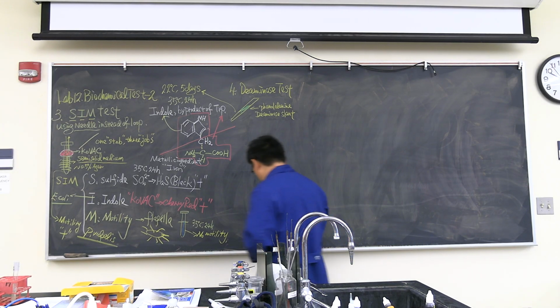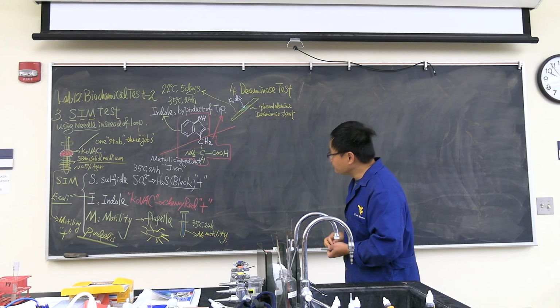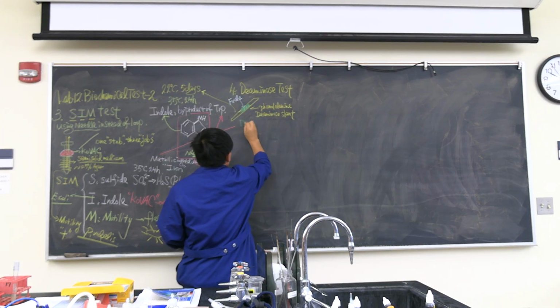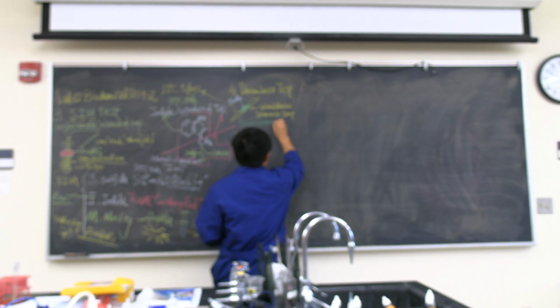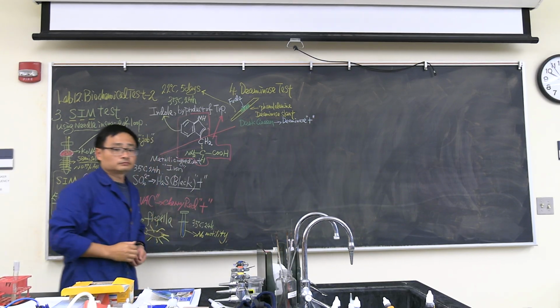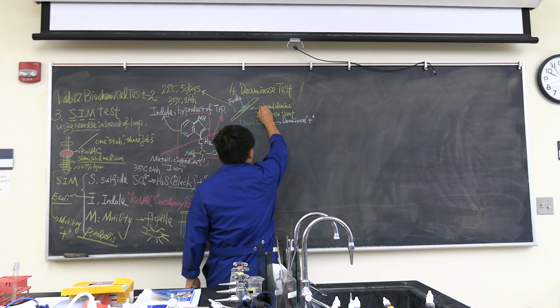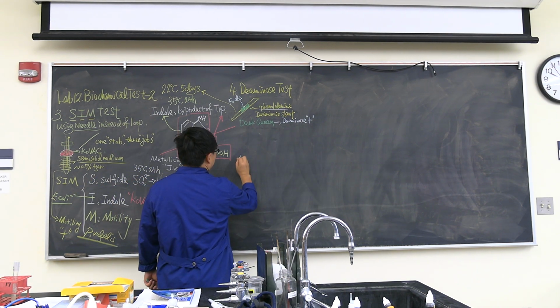And then what we do, we add a special dye called ferric chloride. If you see it turns dark green color, which means the deaminase positive. Okay, now the story is, what's the principle behind it? You need to know what is phenylalanine. So what is phenylalanine? Let's talk about it.